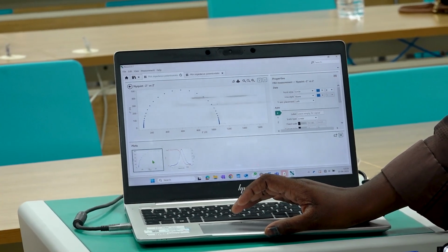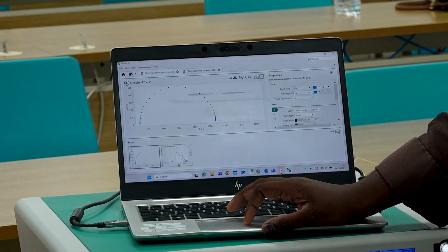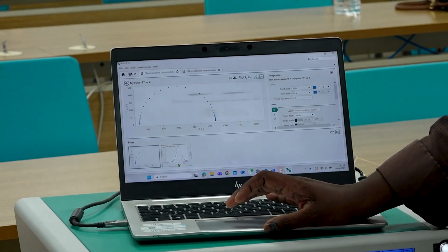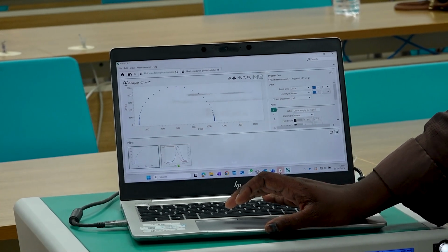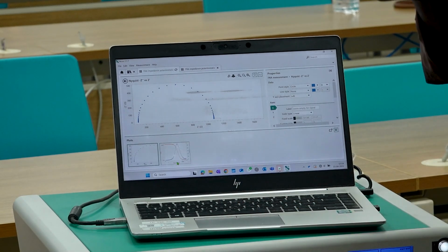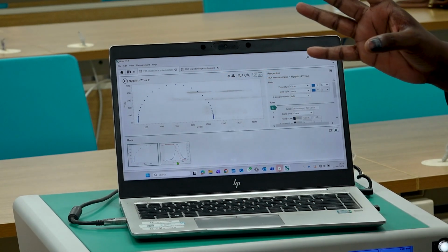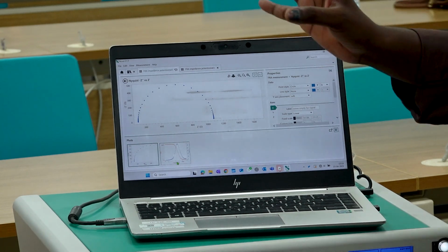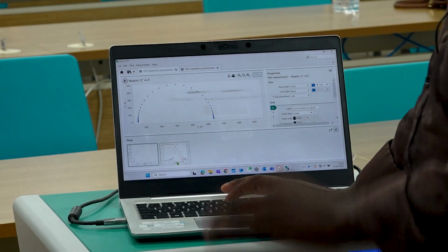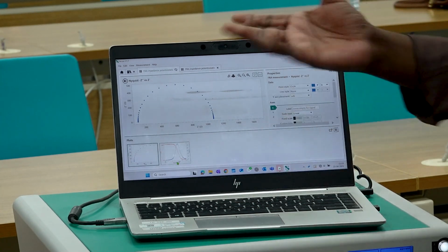The first graph is the Nyquist plot, the second is the Bode plot. Generally, Nyquist is sufficient for most of the analysis. For very few applications only, Bode is required. So what are the two plots' names? Nyquist and Bode, B-O-D-E, Bode.